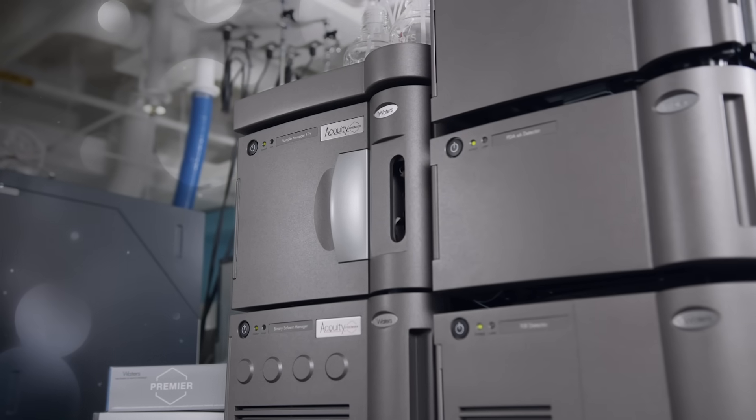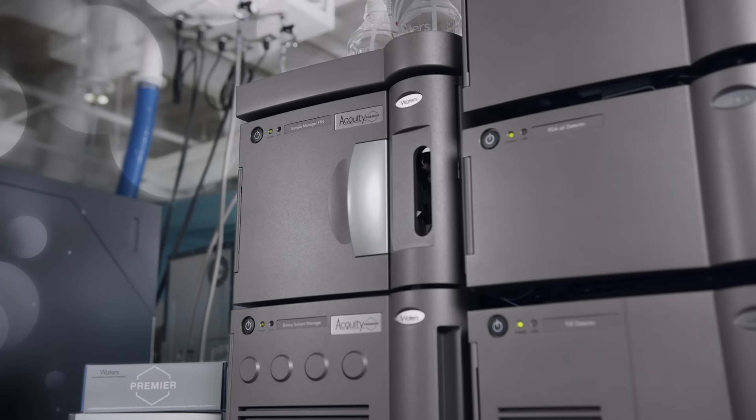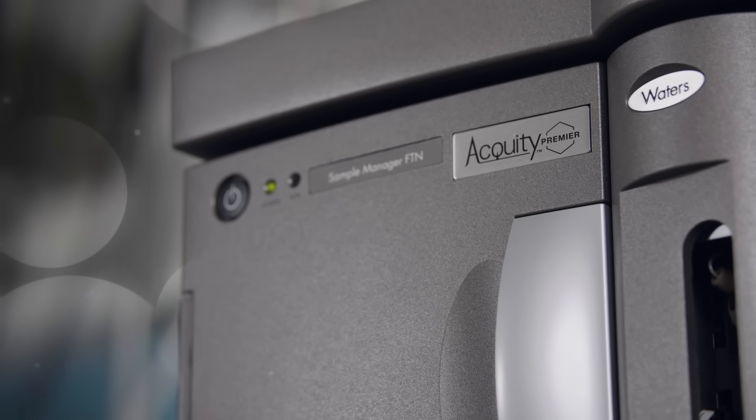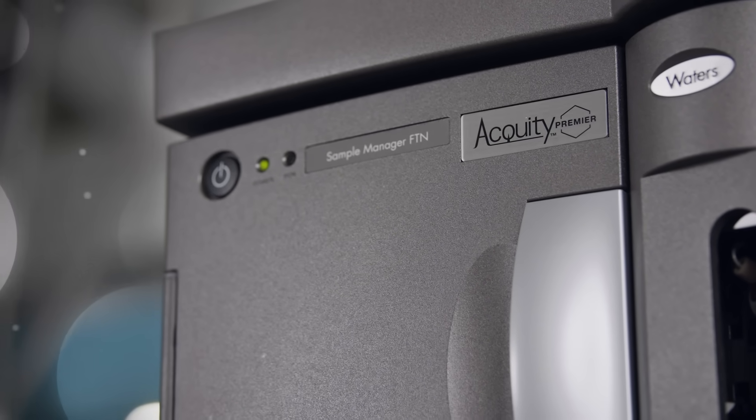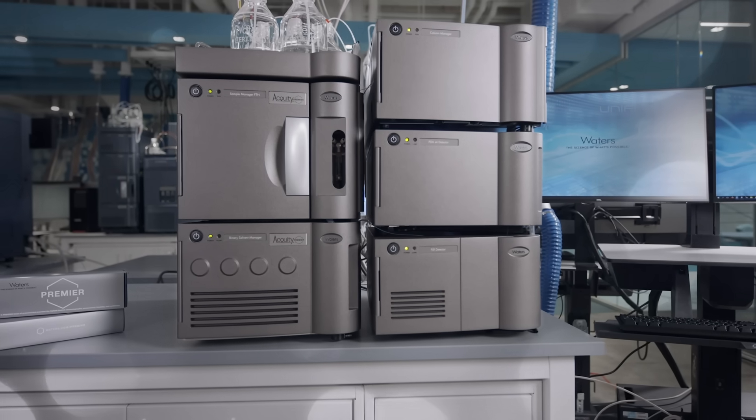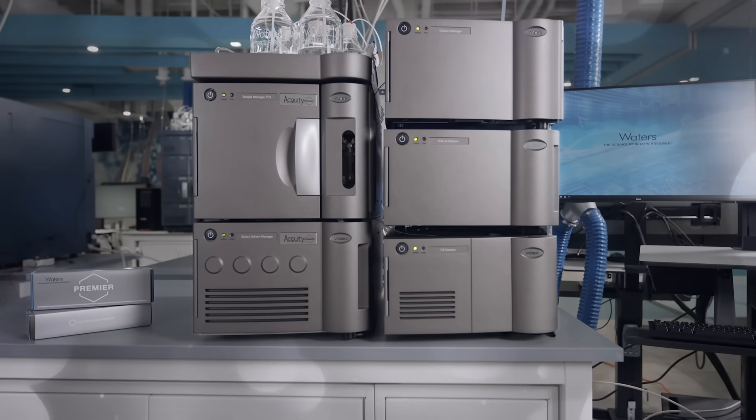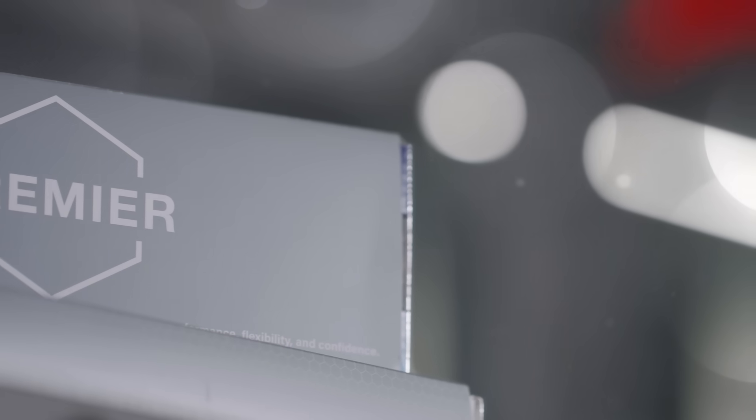The Acuity Premier System solution with MaxPeak high performance surfaces is specifically designed to eliminate the unpredictability of analyte losses due to metal interaction and reduce risk by allowing you to see and do more in your chromatographic analysis.